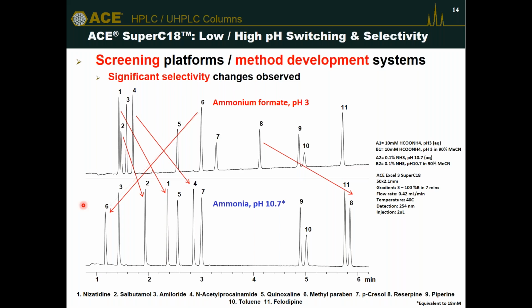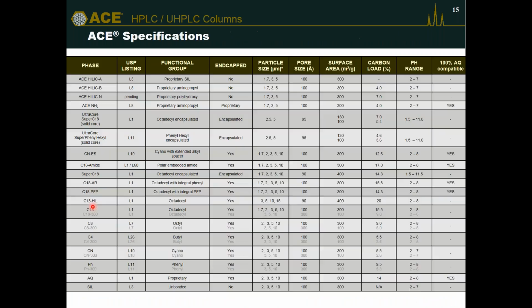Of course, across such a wide pH range, when our analytes gain or lose protons, their polarity changes and their retention changes significantly in reverse phase chromatography. So we have here, for example, compounds being retained more or retained less as we move across the pH range.